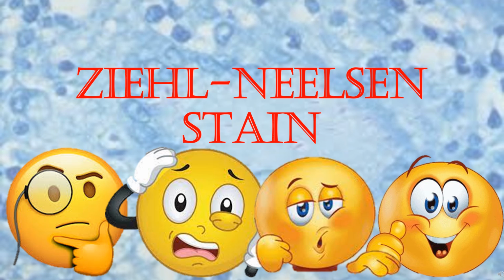In today's video we are going to learn about Ziehl-Neelsen stain, its objective, principles, reagents, preparation of reagents, procedure, results and interpretations, applications and limitations.